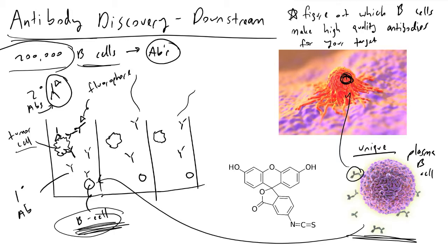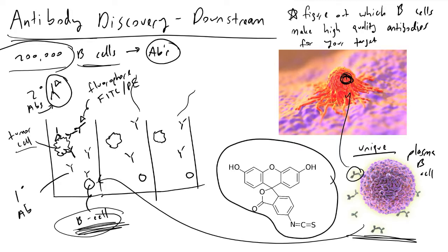And fluorophores are FITC and PE, and there's several other types of fluorophores. The point behind these fluorophores, and this is a sketch of what the FITC fluorophore looks like, is that we've just conjugated it onto our secondary antibody. The important thing that we get from these FITC fluorophores, or any fluorophores, is an absorption or an excitation and an emission wavelength.